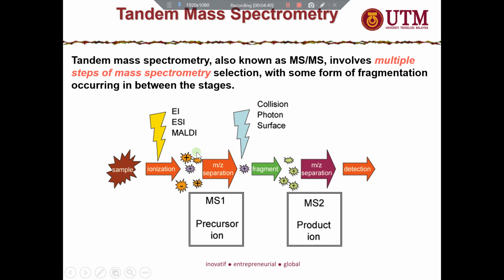Okay, you have some of the ions. For example, you have ions at 153. Maybe from there you run all the molecules, right? You run the whole mixture, then you will have multiple compounds inside your analysis. Okay, so if you look at the chromatogram, there are too many peaks. You will obtain too many peaks. That's the problem. Okay, because why?